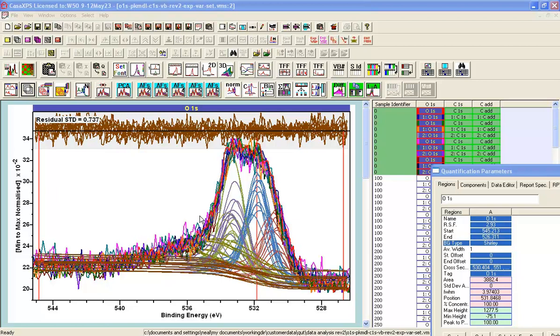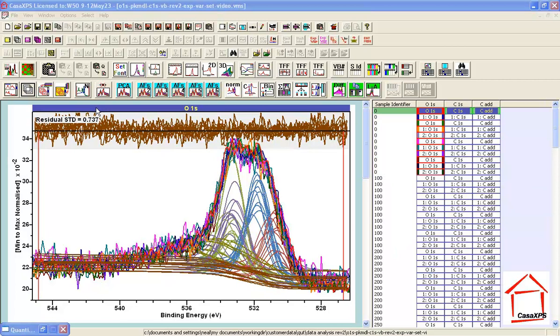We need some method for improving our understanding of what this peak model ought to be before we can have any confidence in presenting it as physically meaningful. When fitting equivalent data with a peak model, the least we should hope for is that the peaks are very similar in position and full width at half maximum across spectra. The problem is that fitting each spectrum independently means small variations in noise, background, and non-linear optimization all produce different outcomes.